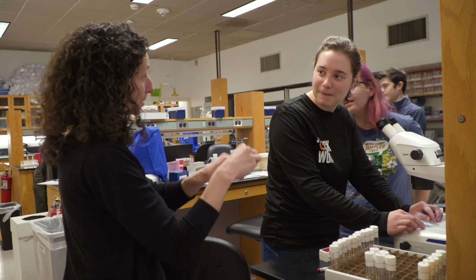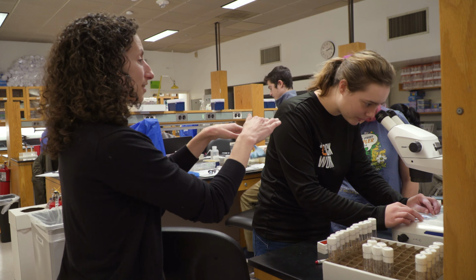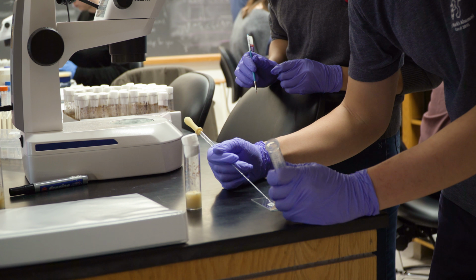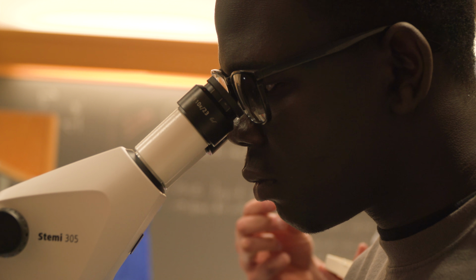Mole 350 is really designed to prepare students as juniors to be able to walk into their labs as seniors, perform their senior thesis, already have the ability to read primary literature. So they work with Drosophila, and they're focusing on the tracheal system of flies. It's incredibly analogous to the vertebrate vascular system.